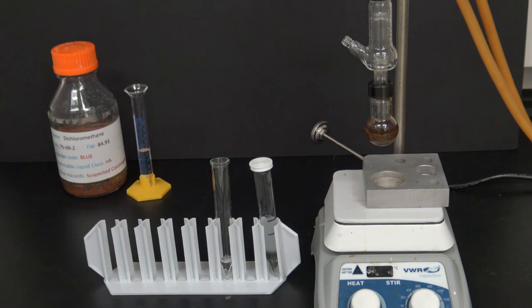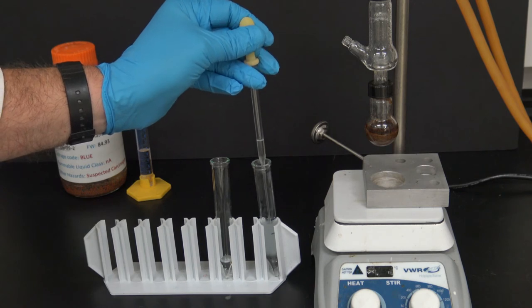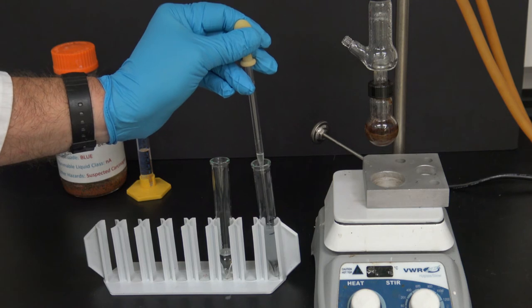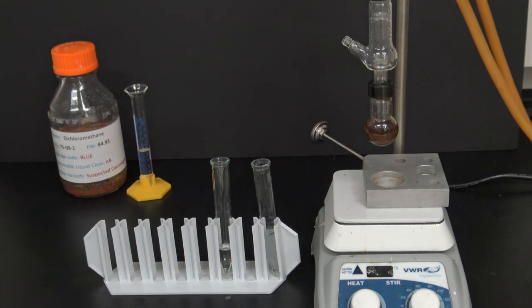Now I'm going to carefully remove the methylene chloride layer, which would be on the bottom because it's more dense than water. This is one of the few organic molecules that's more dense because it contains chlorines. So I'm going to go down to the bottom. Add that to my methylene chloride layer. Go down to the bottom. Add my methylene chloride layer. Okay. Now I'm going to add and do that one more time.